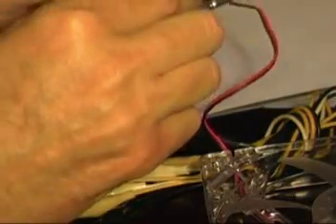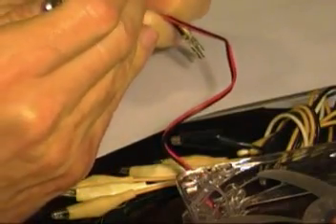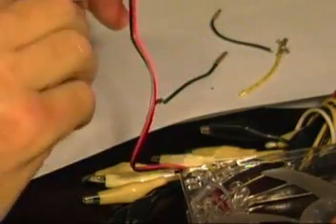Here I'm removing the pins from the other side. We're basically going to connect it just with two wires. Here I'm cutting off the extra connectors.